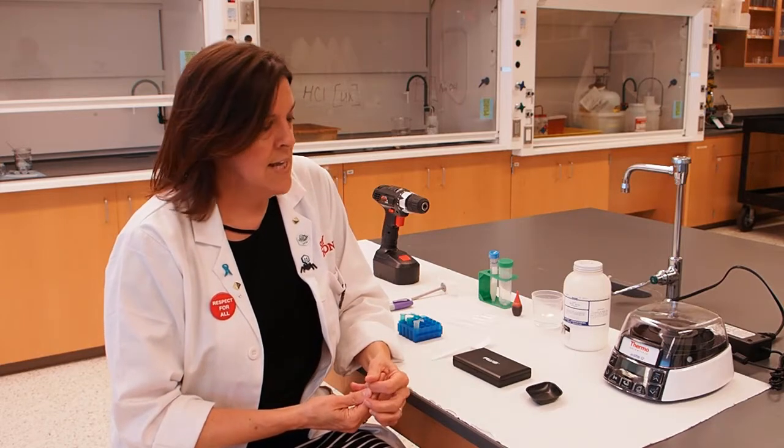The technique you're going to learn about in this activity is called centrifugation. Scientists use centrifugation when we want to do things like separating solids from liquids in mixtures.